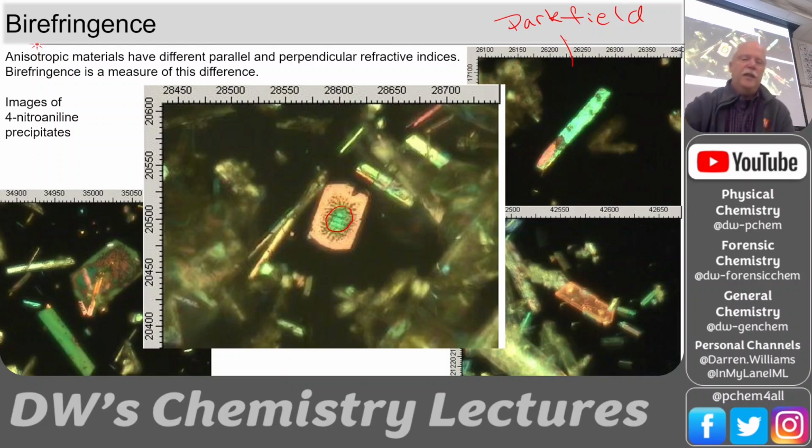You can see that in this big plate-like crystal here, it had a little bit of solvent still on the surface. Then when these crystals were filtered, that solvent left a pothole, if you will. When that solvent evaporated, we had this little pothole in our crystal, and we see a different color there. You can see here, this has like a shelf, and that shelf is chipped off in this end of the crystal here.